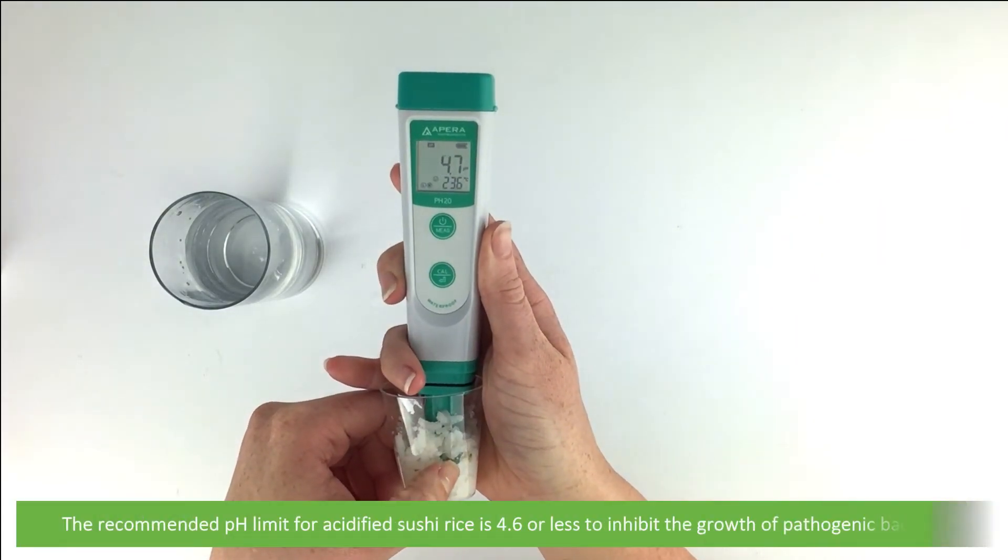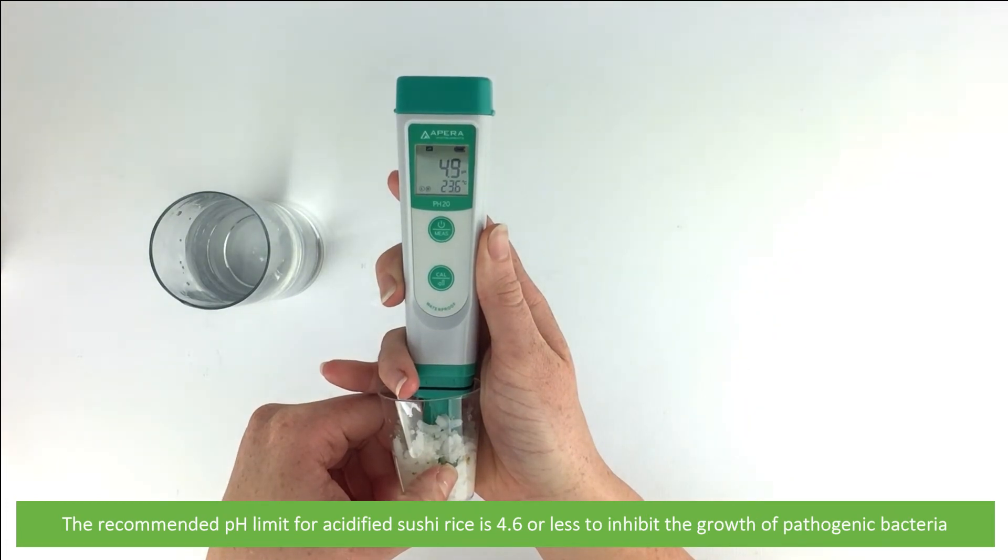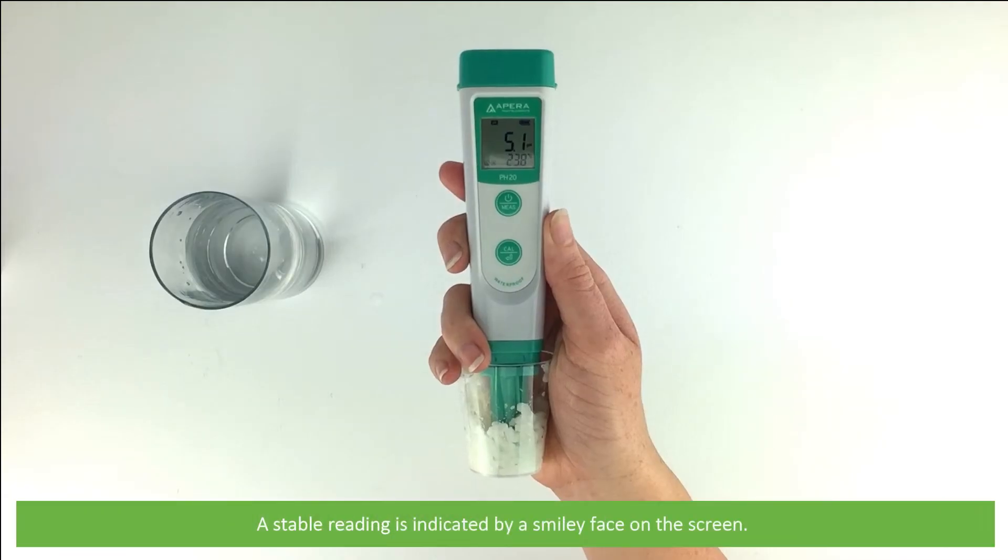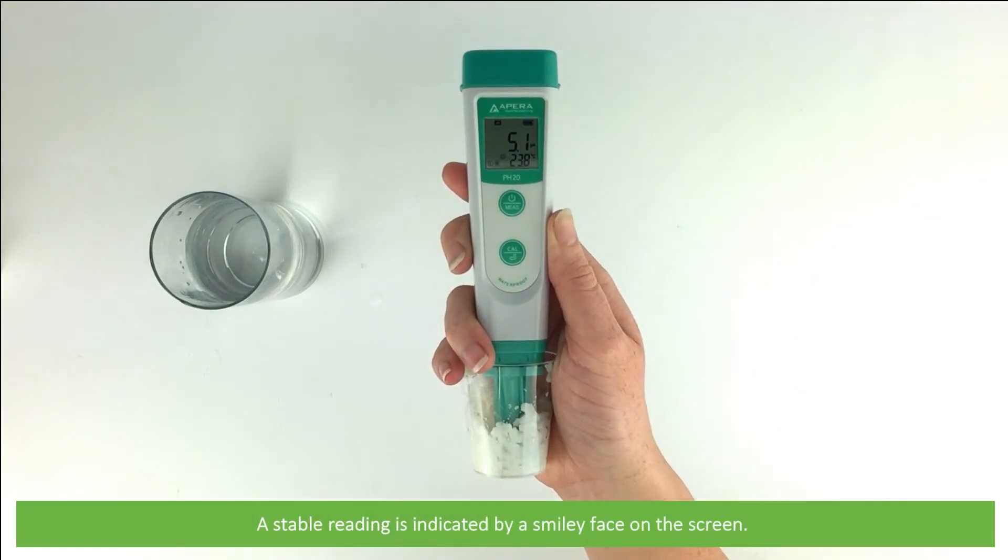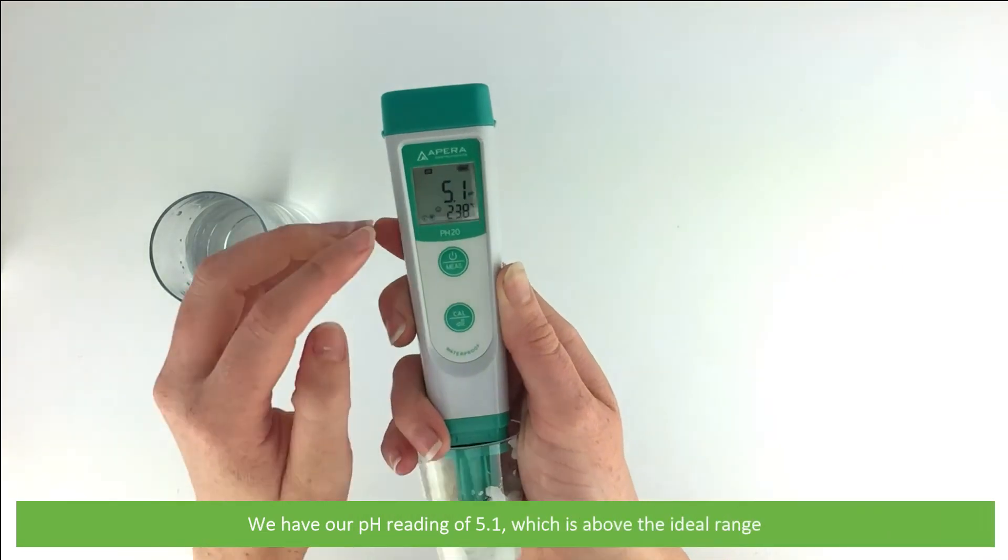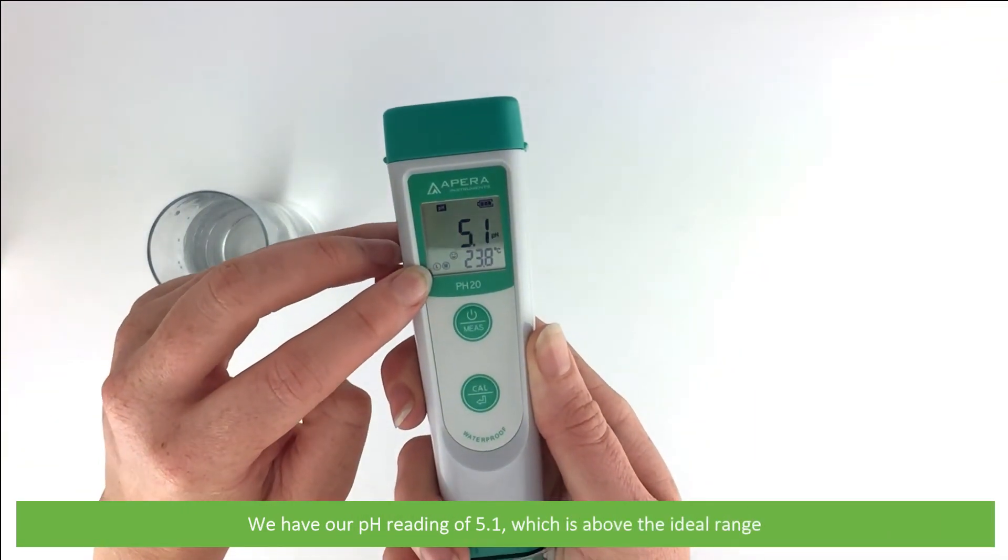The recommended pH limit of acidified sushi rice is 4.6 or less. This is to inhibit the growth of pathogenic bacteria. A stable reading is indicated by a smiley face on the screen. We have our pH reading of 5.1, which is a little bit above the ideal range.